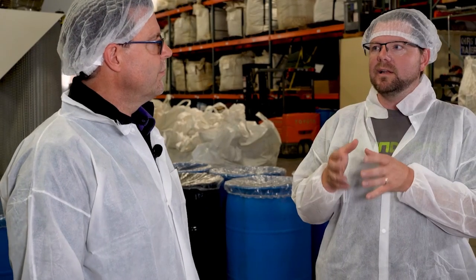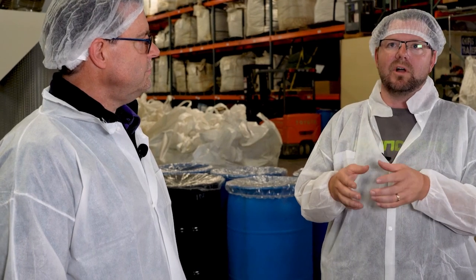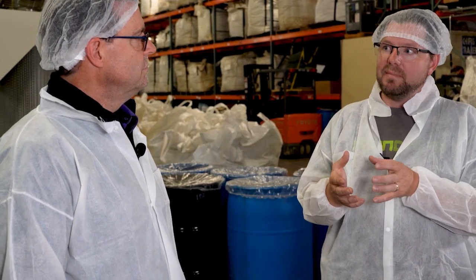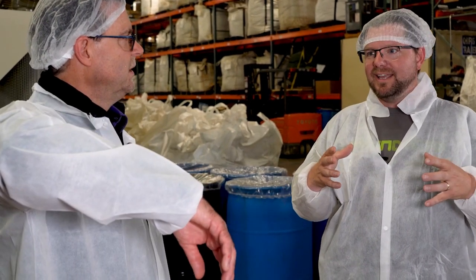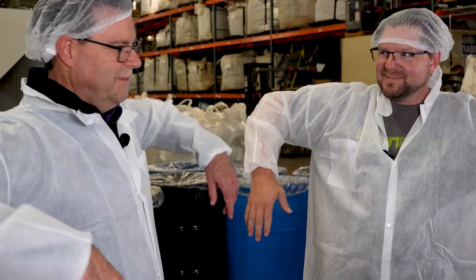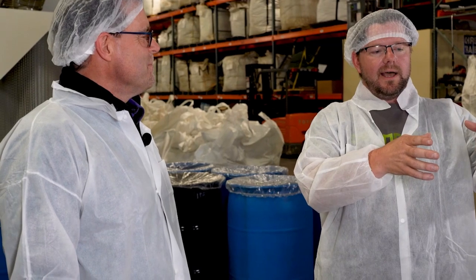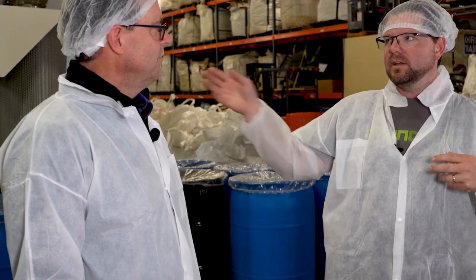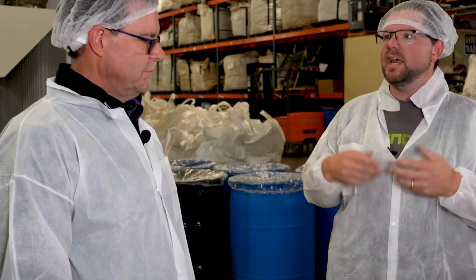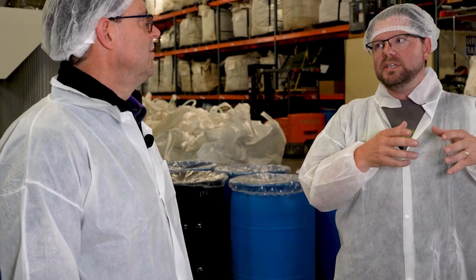The final piece of this is really the analytical side, pulling in all of the analytical work, which we call laboratory information management. A lot of times what people have a hard time integrating is LIMS systems. For example, suppose I have a lot and I'm bringing it into my system, and I need to bring it to QC and have them test it, then wait three, four days and bring it back, with a quarantine in the middle.